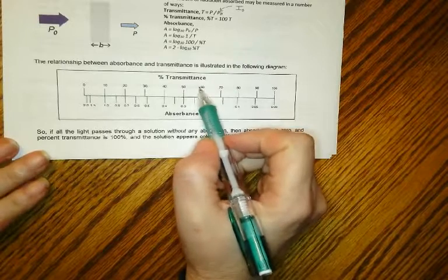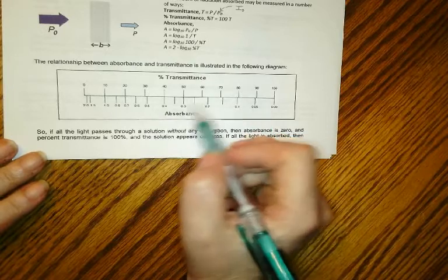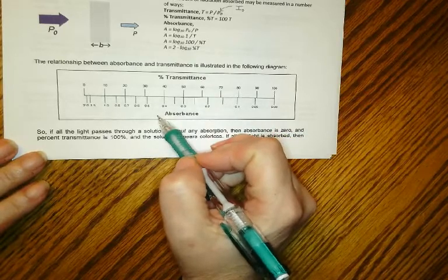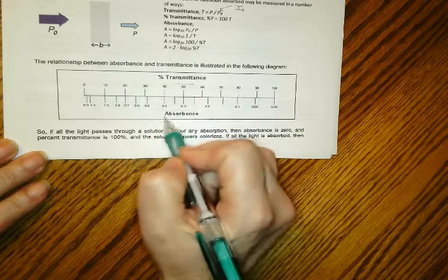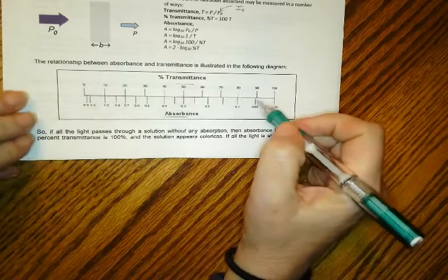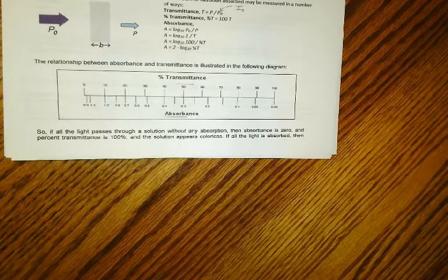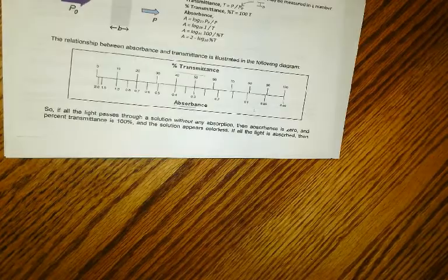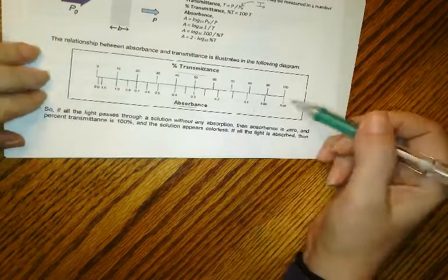So if I had a colorless liquid in there, I'd have 100% transmittance and no absorbance. Percent transmittance is how we do transmittance. Absorbance is based on some other numbers that don't have units. That's to do with optical density. So the numbers, this is in percentage, it won't equal 100, okay?